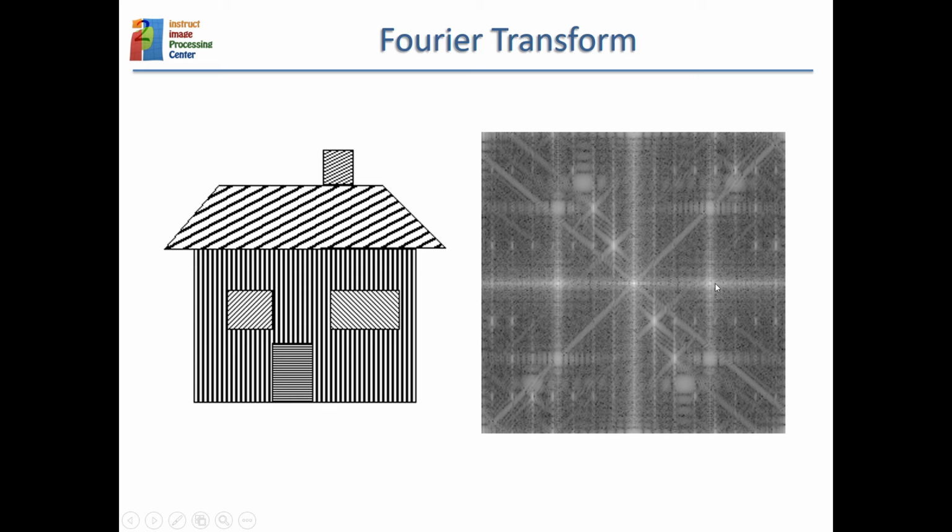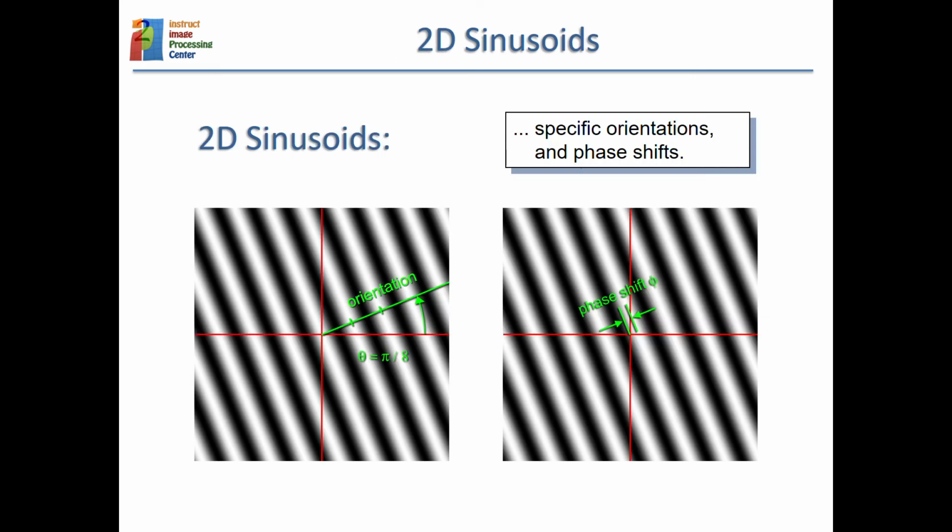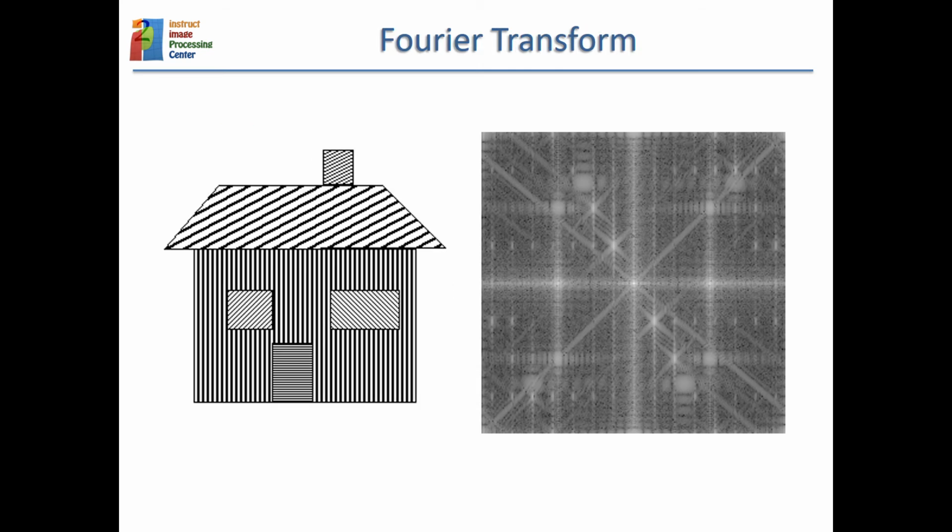This frequency is associated to this period, and then we annotate that we need a lot of energy from that period. This is a technical detail, but you can have orientations that go from 0 to 360 degrees. So you have to annotate that you need this period and also this period, the one that is traveling in the opposite direction but is also vertical. And here is the 0 frequency.